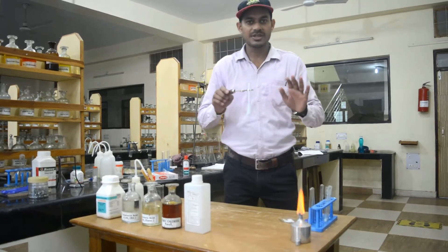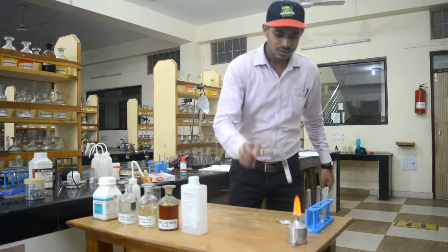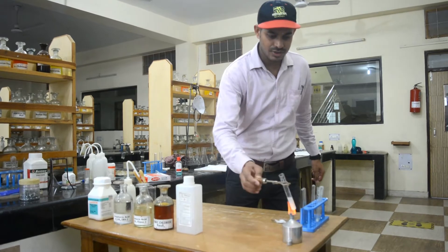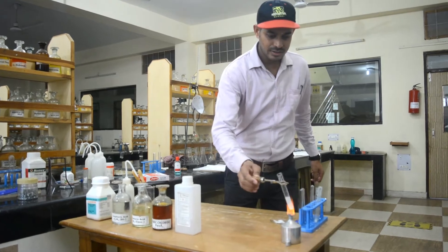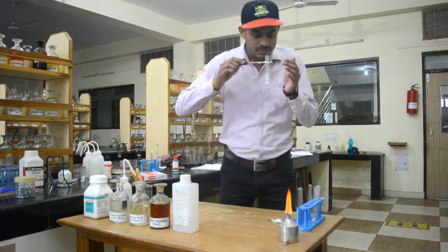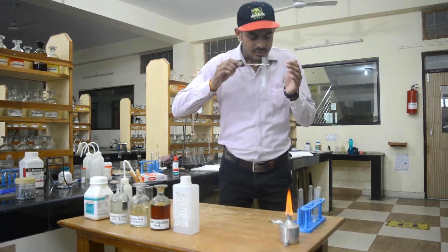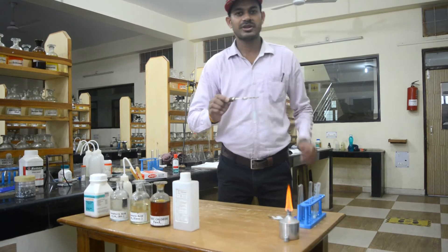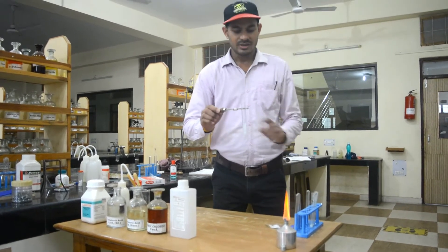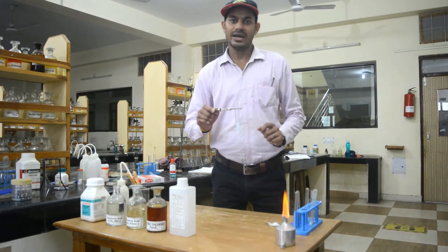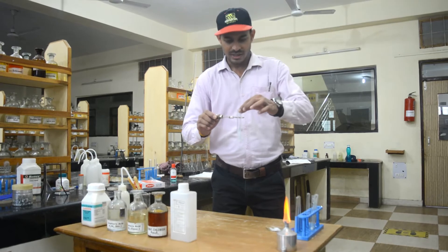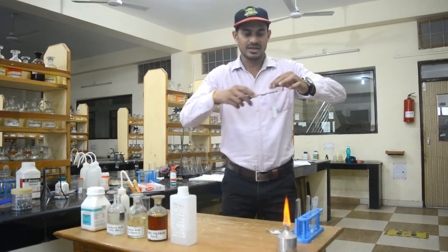If the smell is not coming, we can heat the solution. When we heat the solution, the vinegar smell will start coming out from the acetate ion. Now let us check another test.